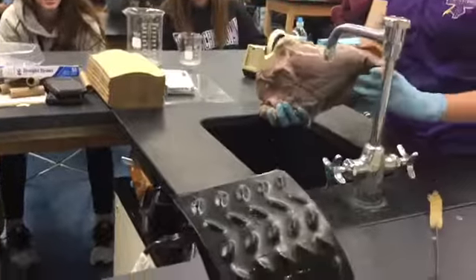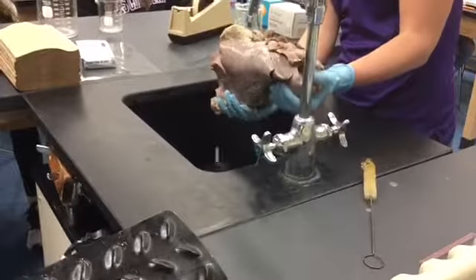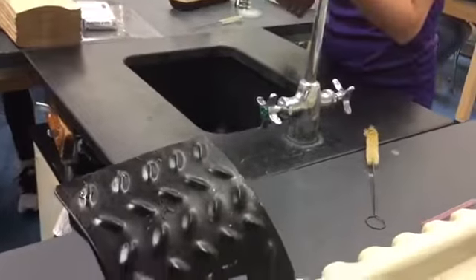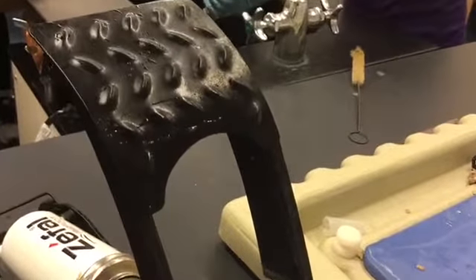So the preservation fluid has fully infiltrated the lungs. If you were to feel the lungs, they feel like a sponge and they are full of fluid. Sorry, every time I inflate it, I have to drain it for the first half of the day.